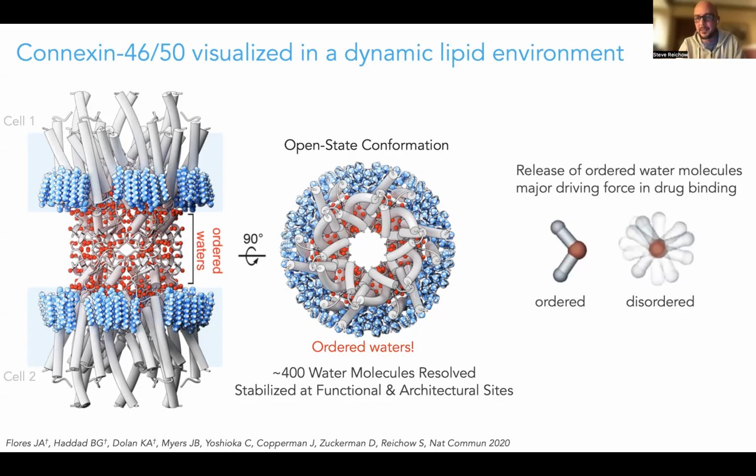So I think the other important thing about water, just to make one more note, is from the point of view of structure-based drug design. Understanding where these water molecules are is very important for drug design, because if you can design drugs that displace these waters, you can often get a large increase in the delta G of binding by releasing those waters back to the system through entropic gains, right? So it's important for structure-based drug design and being able to reach these levels of resolution.